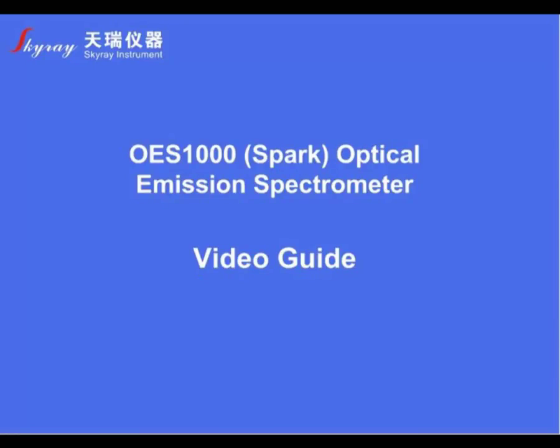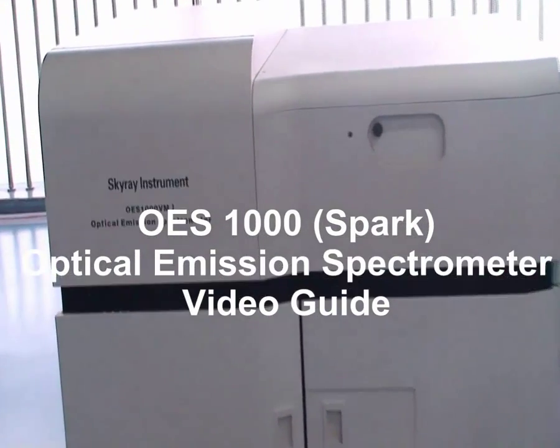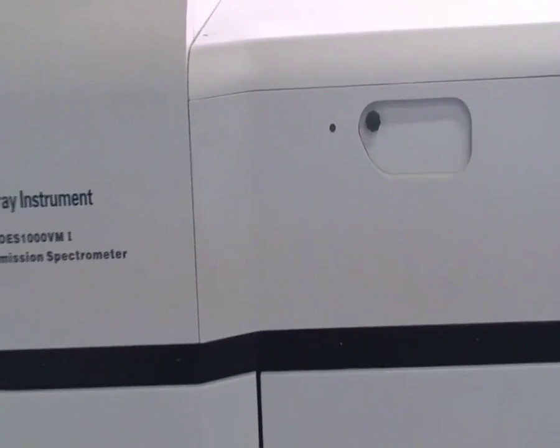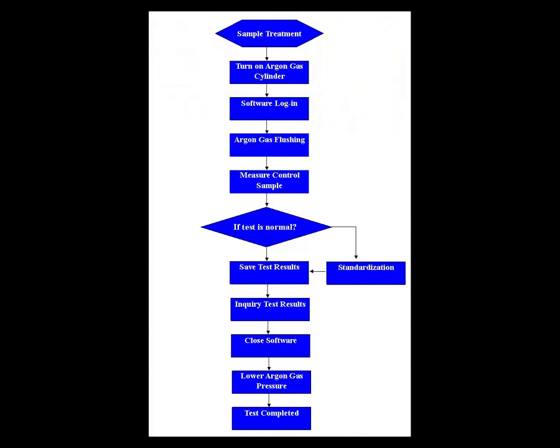Welcome to watch the OES1000 Spark Optical Emission Spectrometer video guide. Let's take a look at the operation flow chart.